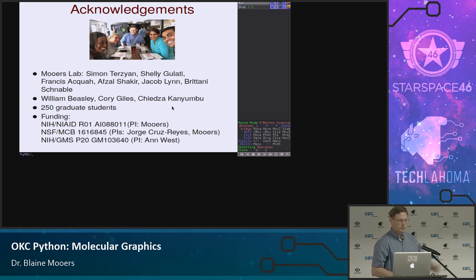Oh, most definitely. So this can be used with any molecules. All you need, all the raw data, are just the XYZ coordinates of each atom. That's it. It's very simple. So it can read in about 50 different file types. So atomic coordinates come in all kinds of different formats, as you know. And so it's not just restricted to proteins and PDB files.